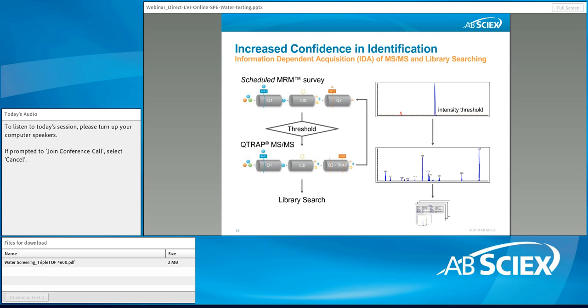And so here we get true quantitative and qualitative information in a single analysis. We can quantify the MRM chromatogram, and then on top of that we get the MS spectrum. We can search that against a library of different environmental pollutants, and the library score, pretty much like in GC-MS, allows us to identify compounds with very high confidence.